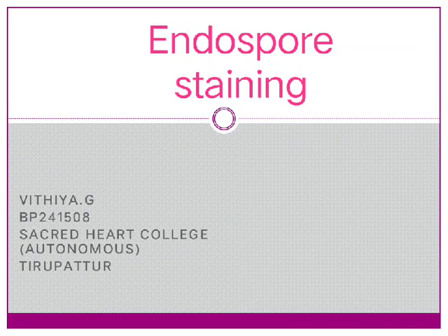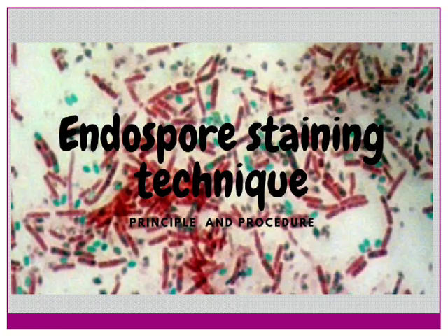Hello everyone. Today we will see about the endospore staining technique, its principle, procedure, result and differences. Now let's see the introduction of endospore staining.